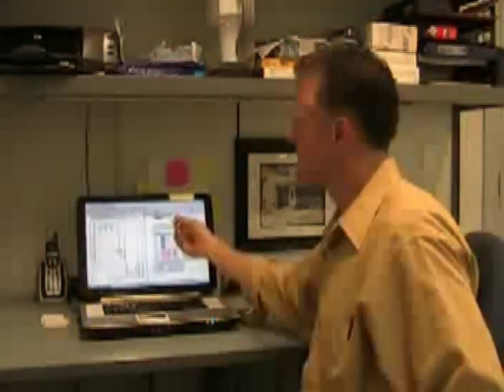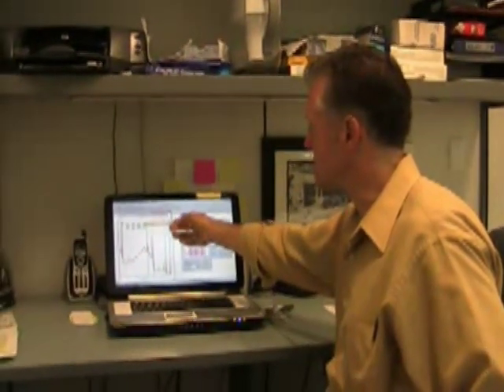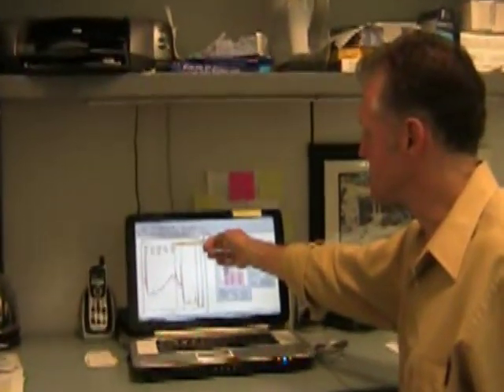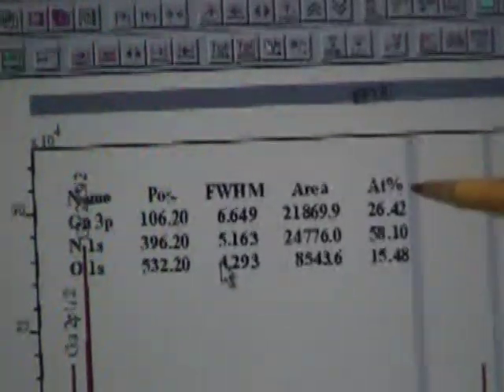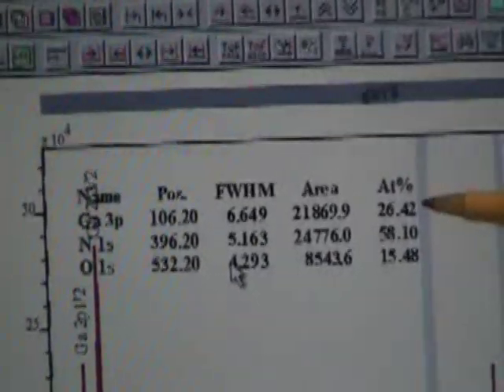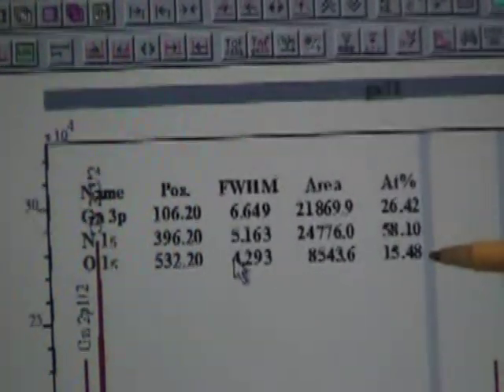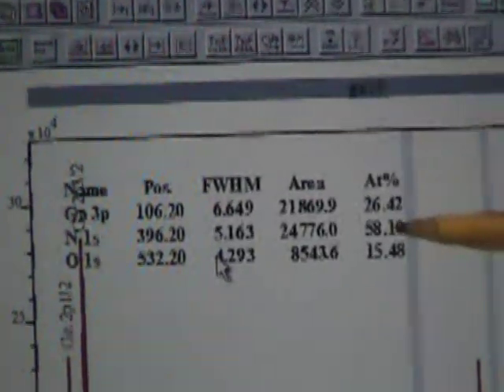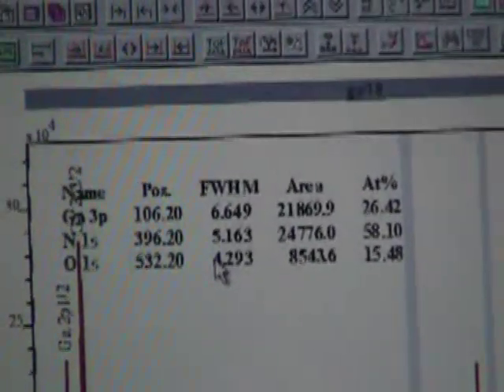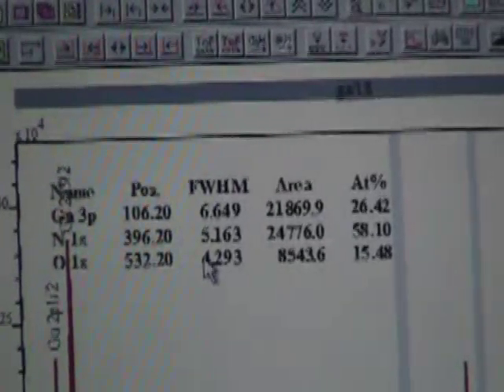So we have to expect that there may be, again because we're only looking at the very surface with XPS, that there will be a little bit of oxidized gallium in the top monolayers. So we have to be on the lookout for that. So we have gallium, nitrogen, and oxygen, and we're modeling this as atomic percentages. We can think of it as the surface as being modeled as 100 atoms. In that case we have 26 gallium atoms, 58 nitrogen atoms, and 15 oxygen atoms.